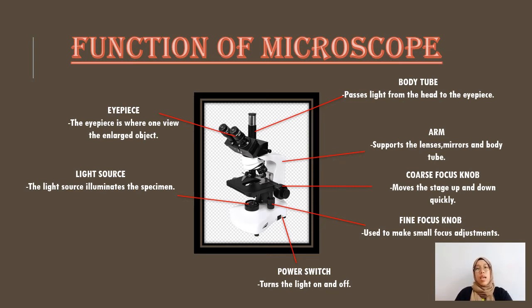The next is light source. The light source illuminates the specimen by shining bright light on it. And the last is power switch. Turn the light on and off.